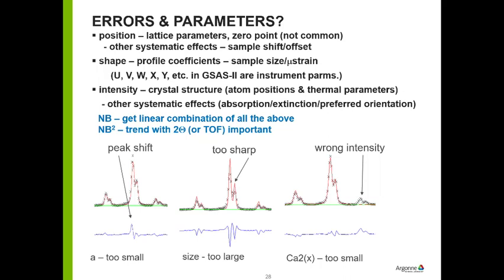And that's a second derivative, and that's because the calculated peak is too sharp relative to the observed peak. So what you see then is going to be these kinds of differences, but unfortunately what you see is a linear combination of them. One of them will dominate, and so that's the one that you have to approach as to what it is that you refine next, because you want the worst thing fixed first in a Rietveld refinement.